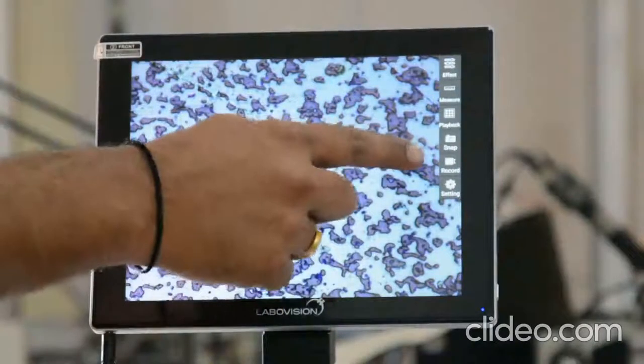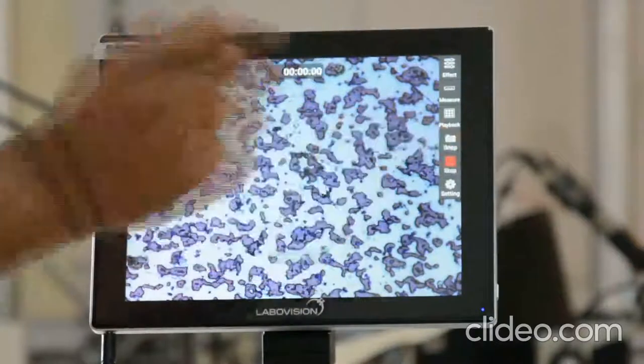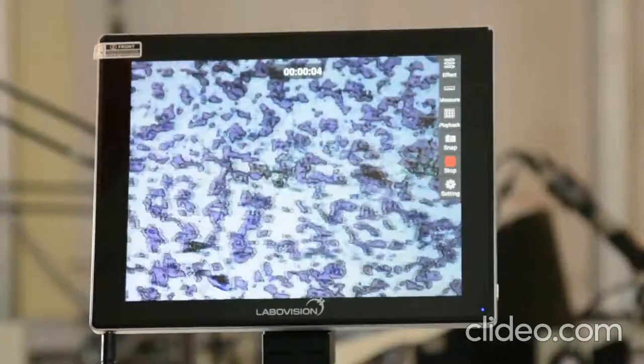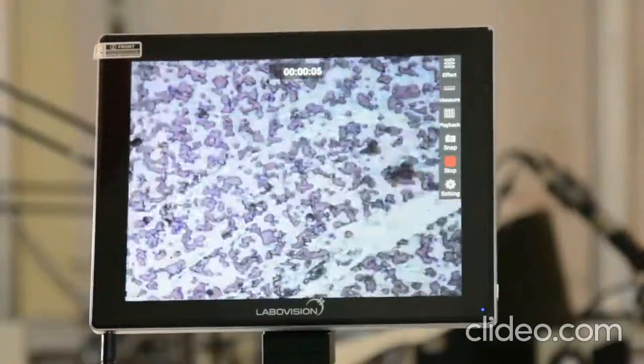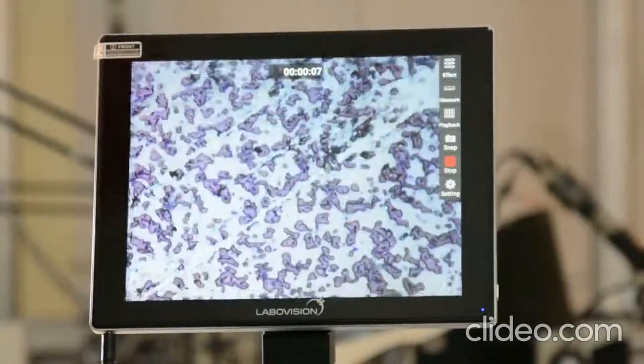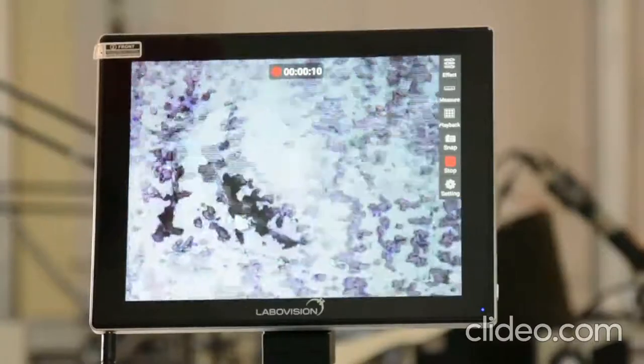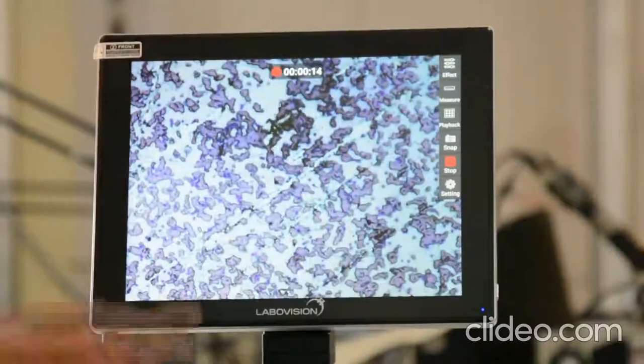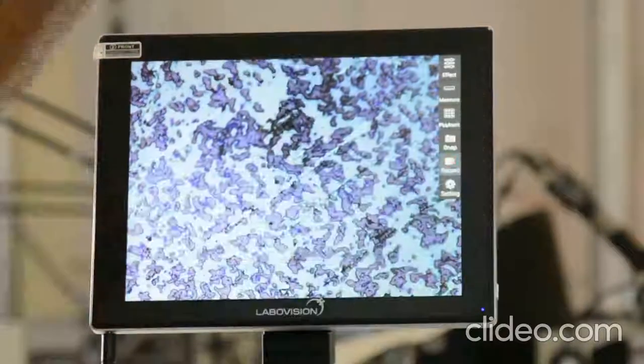You click on the video tab. Now this is the video which has been placed. You can see the timer which is there on the top of the screen. You can scroll. You can check the specimen. Later you can discuss and have a conference about the same. And you can stop it from there.